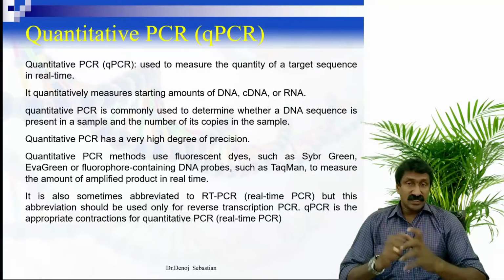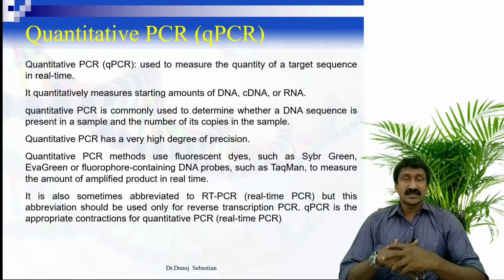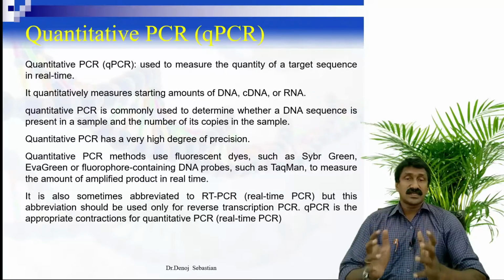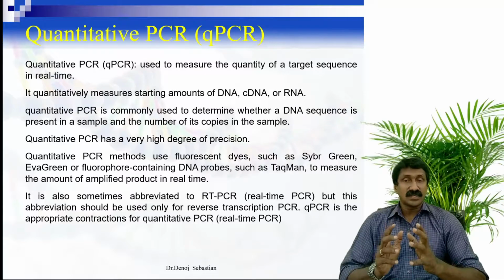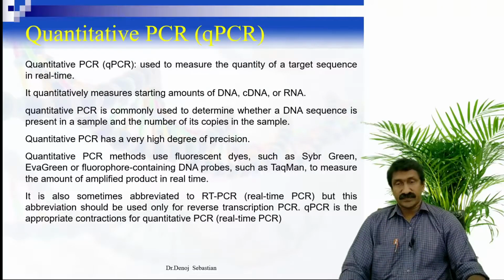Whereas the abbreviation RT-PCR is used for reverse transcription PCR. So you have to keep it in mind. The RT corresponds to reverse transcription, not real-time. Real-time PCR is known as qPCR.